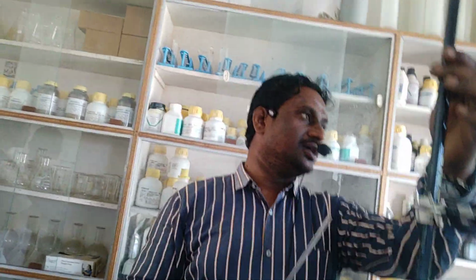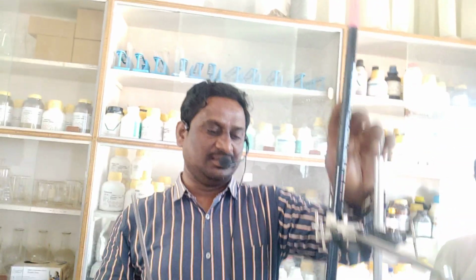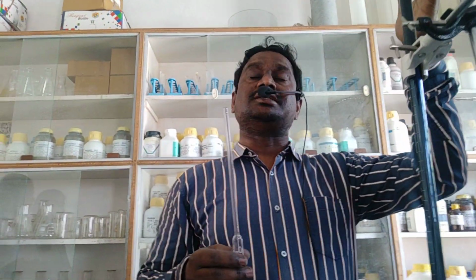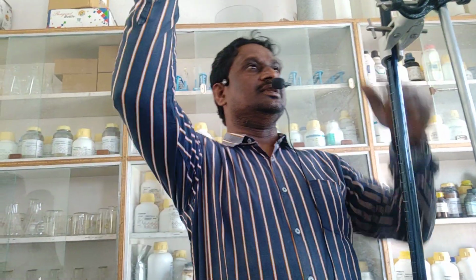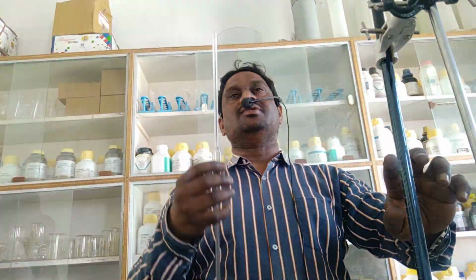This instrument is a burette. This instrument is a pipette. Now if you observe this burette, how much volume can it measure? 50 ml. Here 0 is the start, here 50. Like that, there are 100 ml burettes, 200 ml burettes also. So for measuring the volume of liquids, we use these instruments.